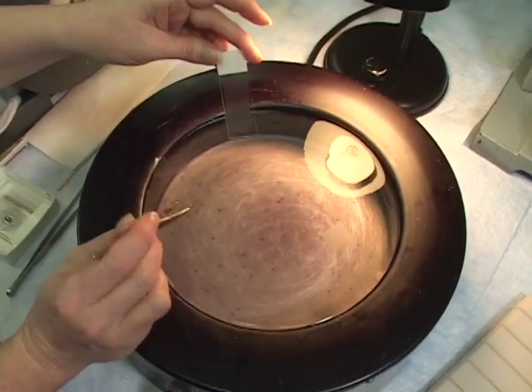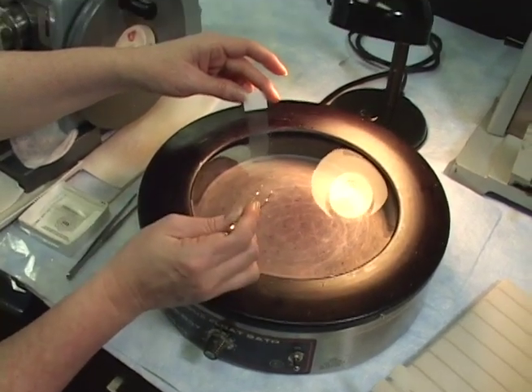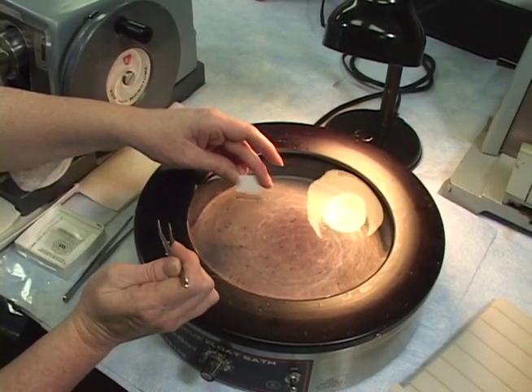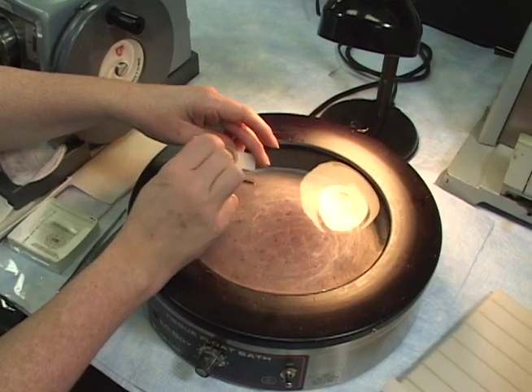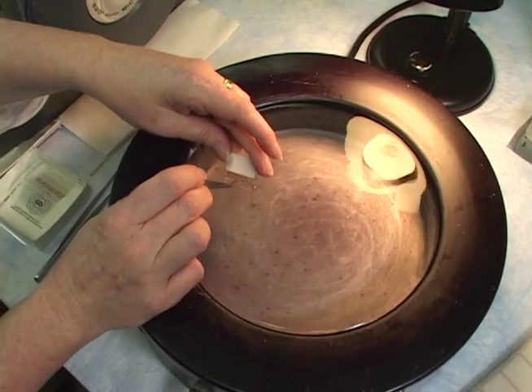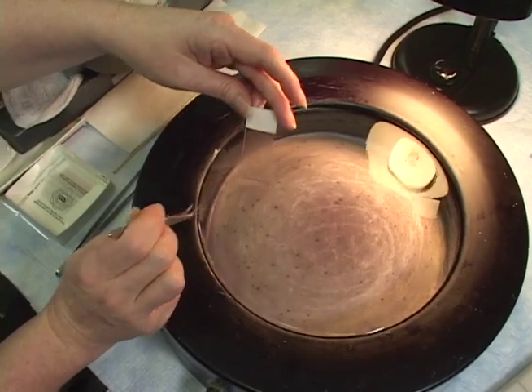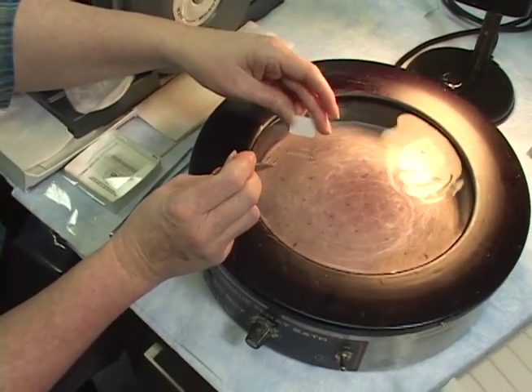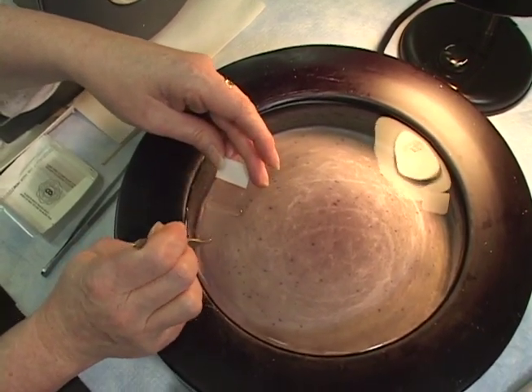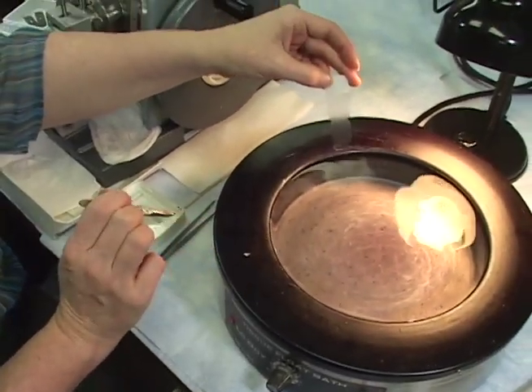Now on a charge slide, it'll stick right away, and you cannot remove it. On a non-charged slide, if it's not positioned the way you want, you can actually unload the ribbon and redo it again. And to prevent it from sliding, you just touch it slightly, and you can load it again. Let's say that was a little crooked, I didn't like that. I'm going to unload it and move it again and put it on there a little more evenly in a different position. So you can do that. On a charged slide, you don't have that option.